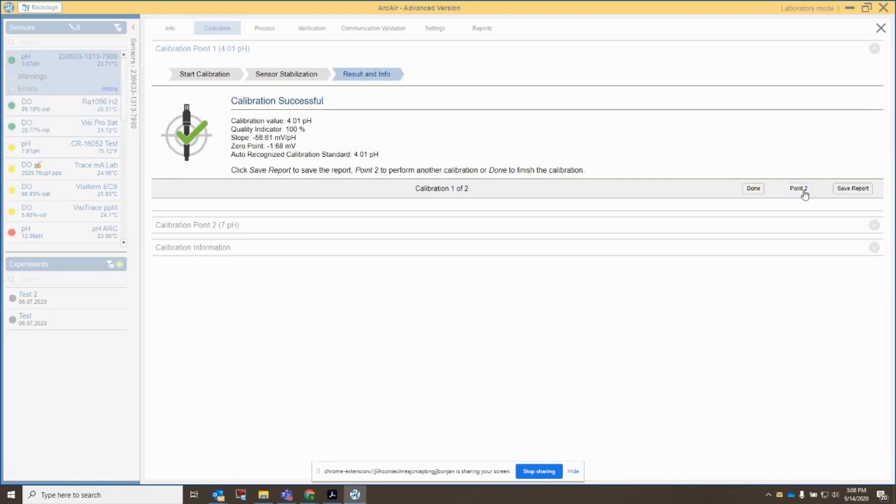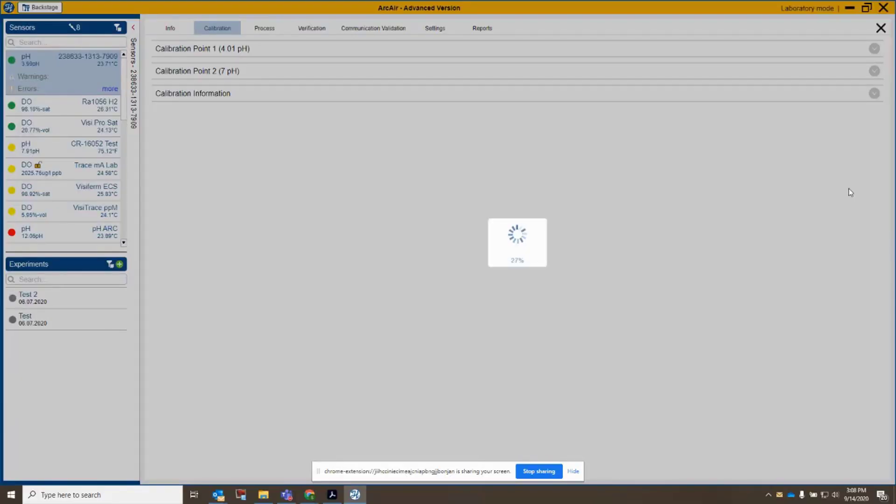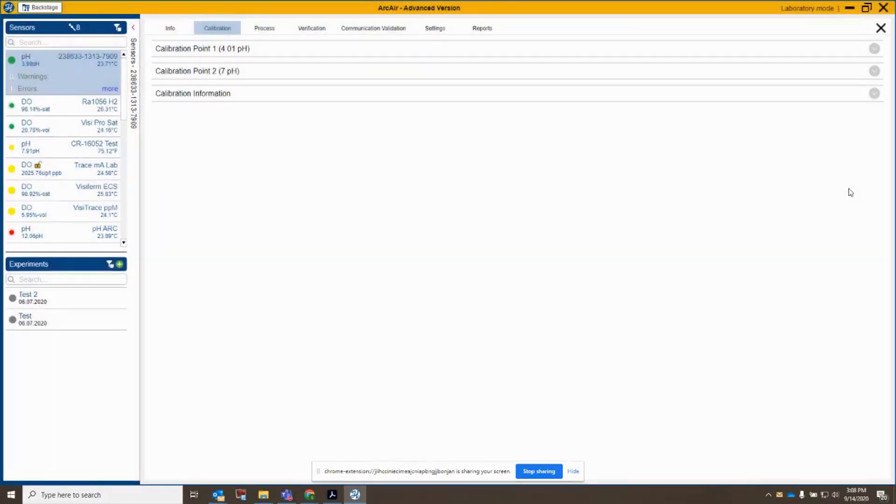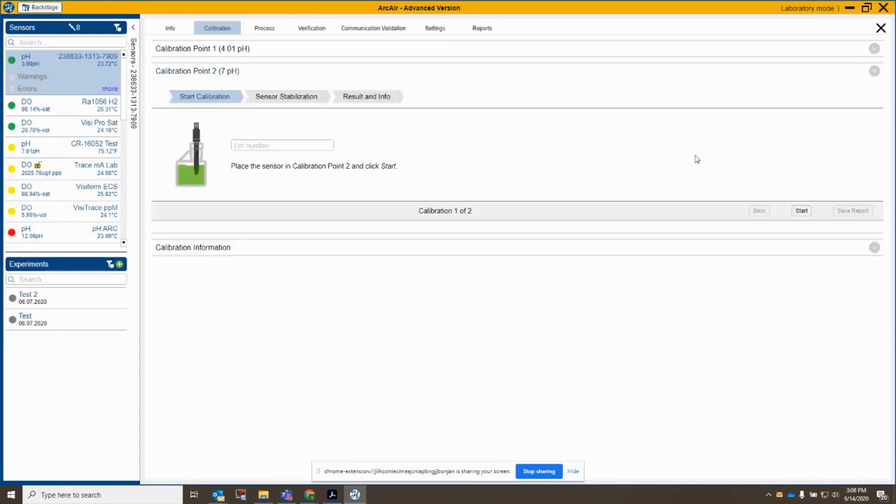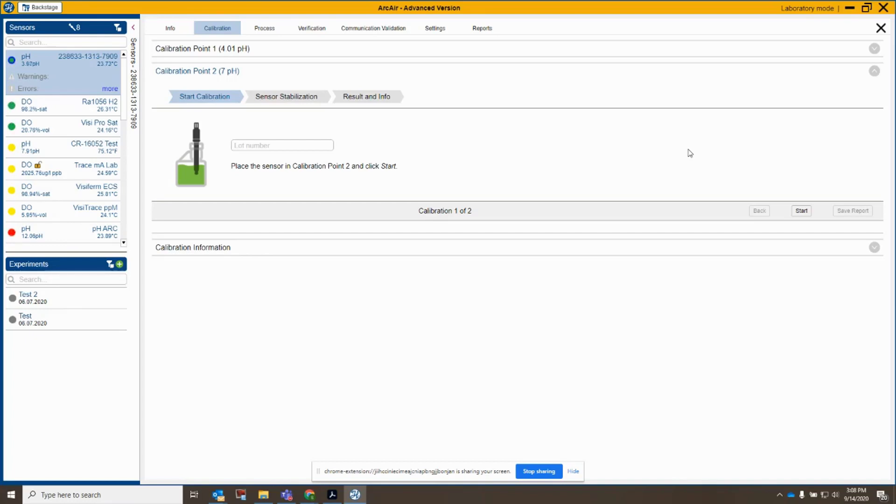So let's click next here and see what we've got. And this time I was able to successfully calibrate at 4 pH. So I'm going to click save here. I can save a calibration report, and normally I would calibrate at 7 pH. 4 and 7 are my most common points, so I would calibrate that as my next point. But sometimes we get customers that want to calibrate at other values.